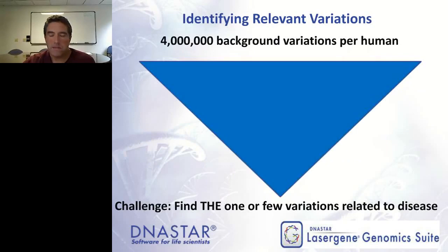So one of the first challenges with targeted resequencing is filtering through the massive amount of noise that can be in next-gen sequencing data sets. A lot of times, if you have some pipeline software, some of the filters are hardwired in place. You might not be aware that with IonTorrent or Illumina data, there's a lot of background noise, and some pipeline software automatically separates that and just picks a parameter.